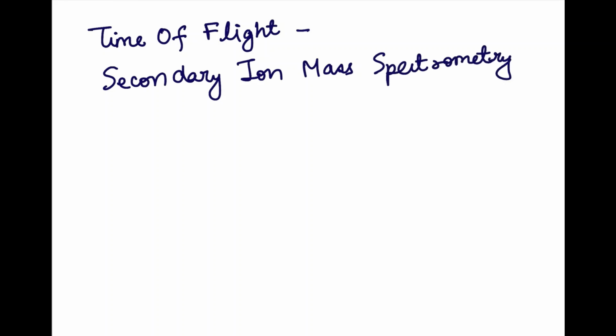Hi everyone, in this video I'm going to give you a brief introduction to a powerful surface analytical method called time-of-flight secondary ion mass spectrometry, in short referred to as TOF-SIMS. Let us begin by understanding the working principle of SIMS.